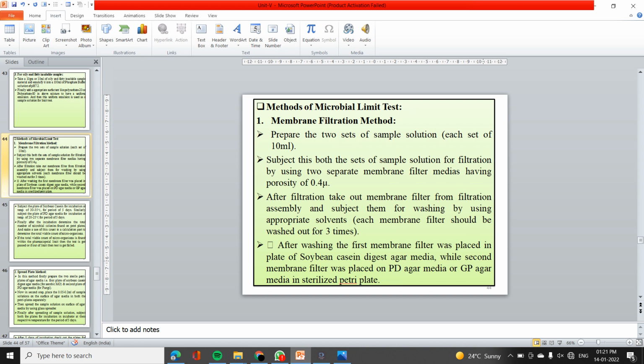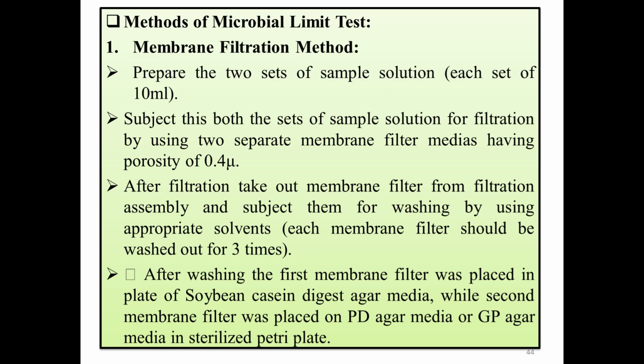Then we perform the filtration. The filter media used in this filtration should have a porosity of 0.4 micrometer, or micron.